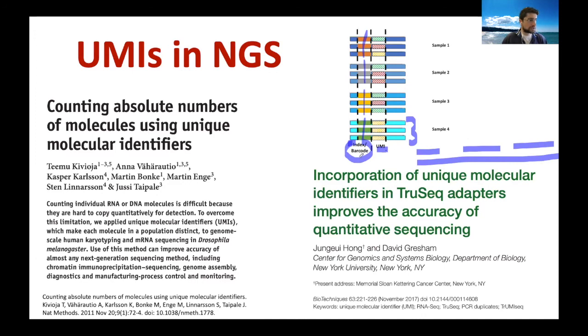I just want to stress the difference between the index barcodes and UMI. So please, if you are starting a new protocol, and I'm telling you, it's a very overlooked thing, but especially in RNA sequencing, for some genes you have crazy coverage, and so it's possible that a lot of fragments are starting and ending at the same position.